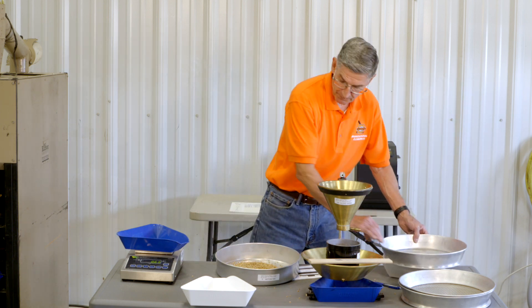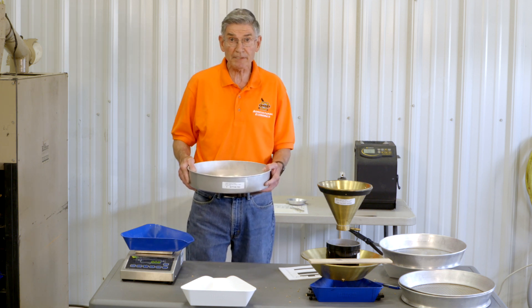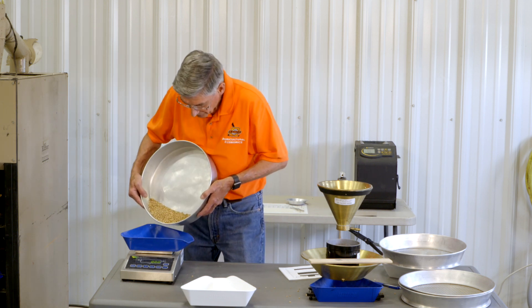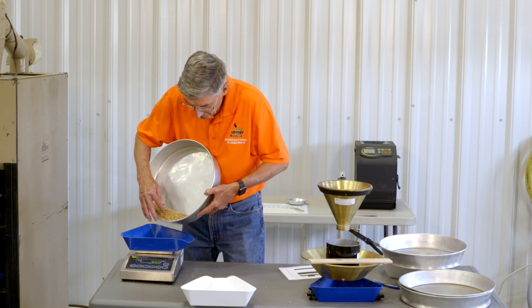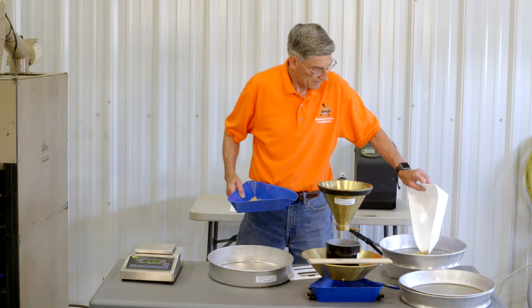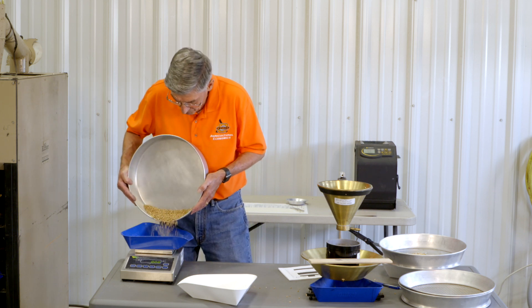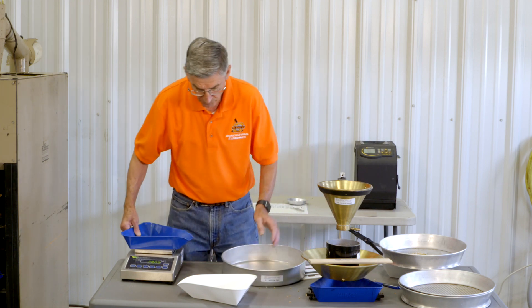Now I want to take that clean sample of wheat and weigh out a 15-gram portion to pick damage and a 30-gram portion to pick foreign material. I have 15 grams even for damage, and 28.1 grams for foreign material.